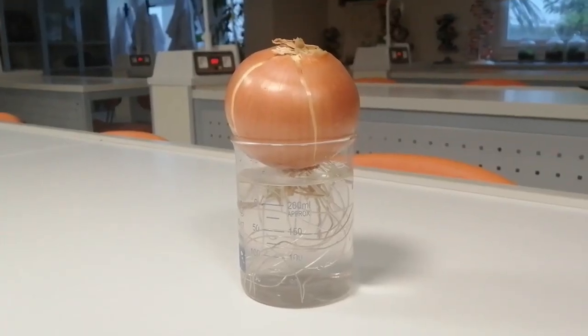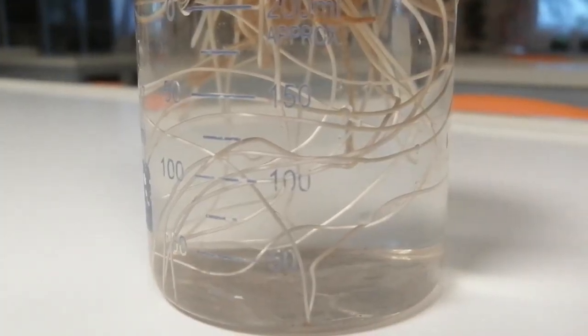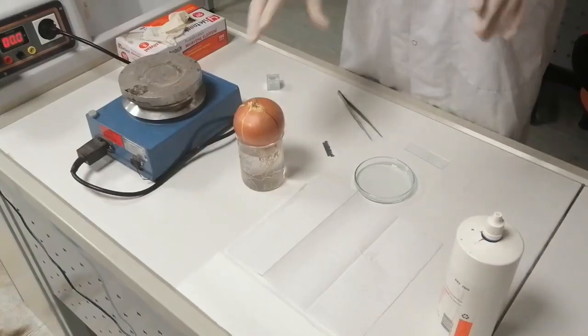Let's start the procedure. Previously, we gave time to onion roots to grow between four to five days in a water-filled beaker.